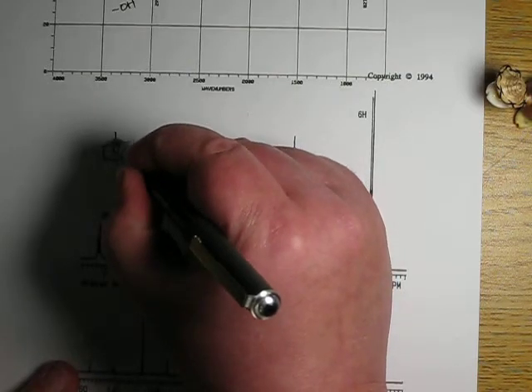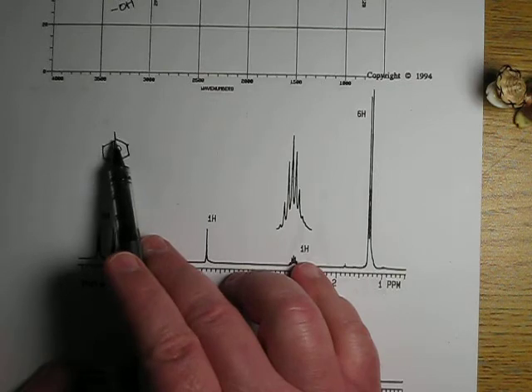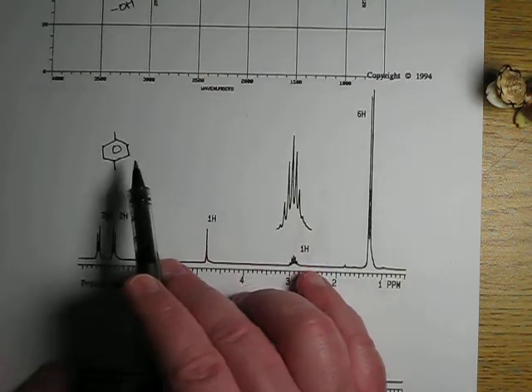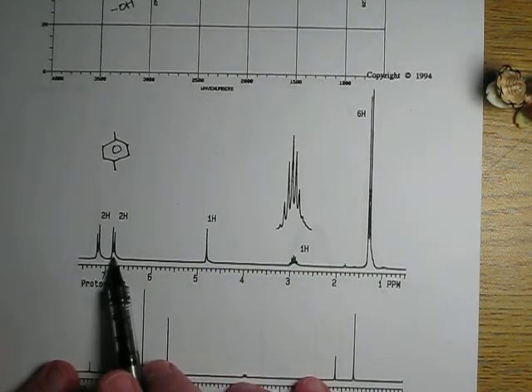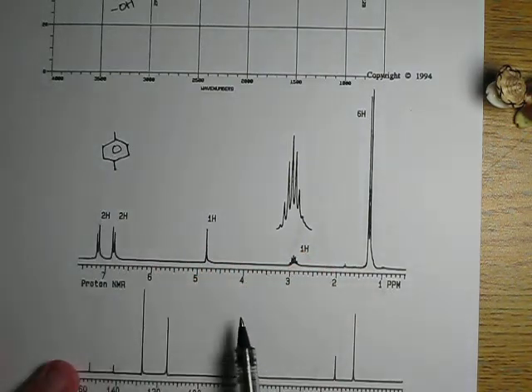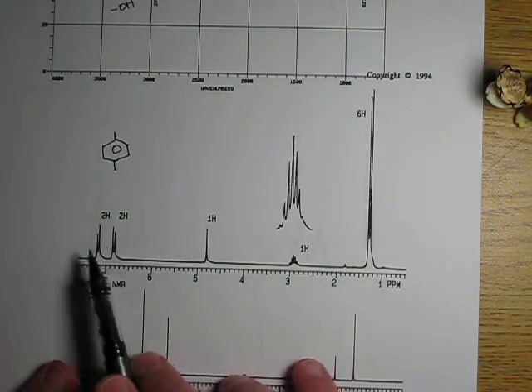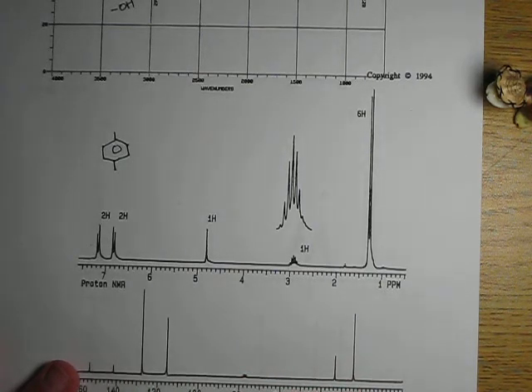That is what we call a para-disubstituted benzene ring, where one substituent, we'll call that carbon 1, 2, 3, 4. A 1,4 disubstituted benzene ring gives this pattern. If you had substituents in other places on the benzene ring, you would not get this pattern of these 2 doublets looking like that.